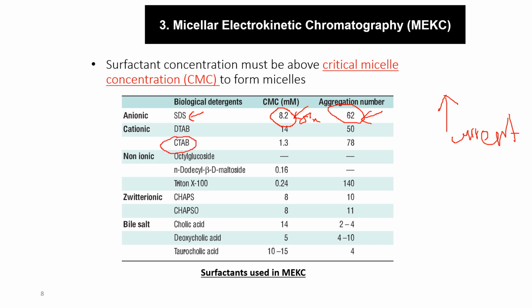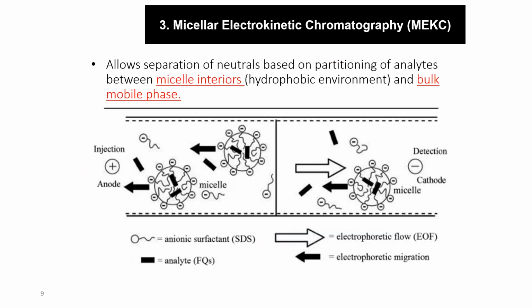Have you found out what is the full name of this? And then we have zwitterionic surfactant. Zwitterionic, I hope you know, contains both positive and negative, which means that we can manipulate. If you want to use positive, you prepare it accordingly. So this is more interesting because it contains both. We don't have to buy two surfactants for our lab. Okay, and then we also have non-ionic. Non-ionic can also help you depending on your application.